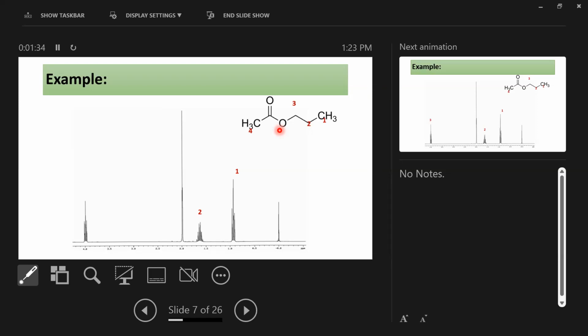All right, so that's another good question. As the signal splits, it splits into smaller fragments based on the neighboring protons. We don't reach there yet, so just give me a minute. We'll talk about splitting and splitting patterns. We just understand the chemical shifts generally first.